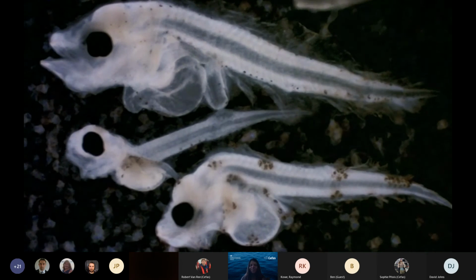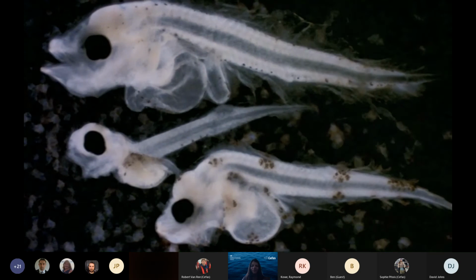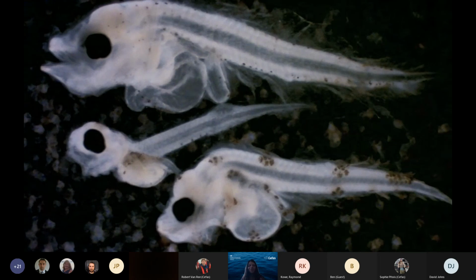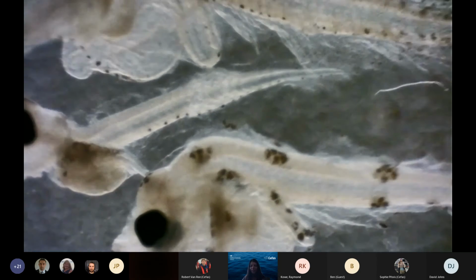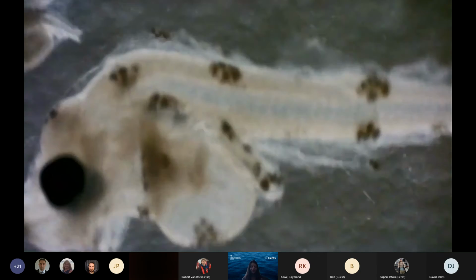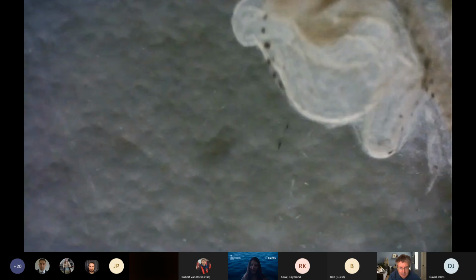So similar principles are applied when identifying fish larval specimens. As a fish larva grows, the pigmentation becomes more distinct. The larva may also start to develop certain features once they reach a certain size, such as spines and developing fin rays. So here in this clip, larvae have been included from species such as mackerel, megrim, and dragonettes.